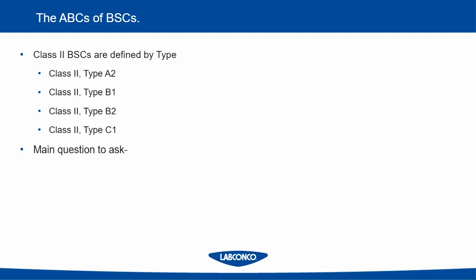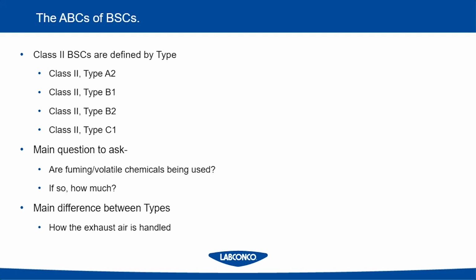The main question to ask as you're trying to sort through what type of biosafety cabinet, what type of Class II biosafety cabinet you need, is: are fuming or volatile chemicals being used in the research? And if so, how much?